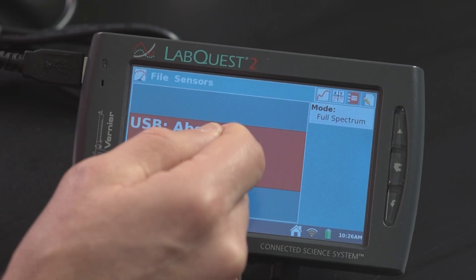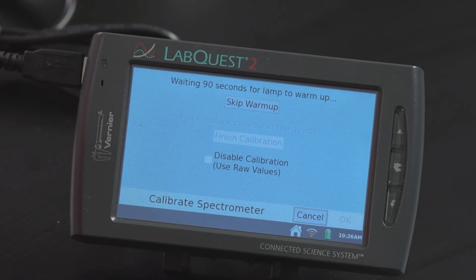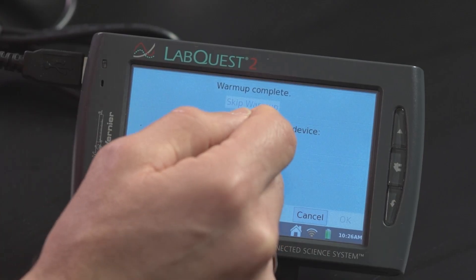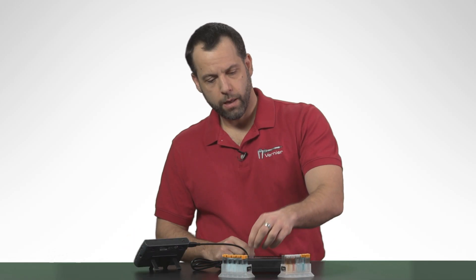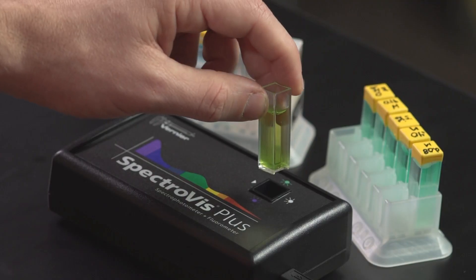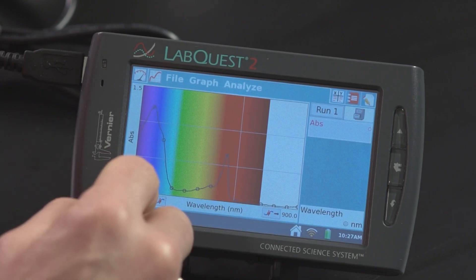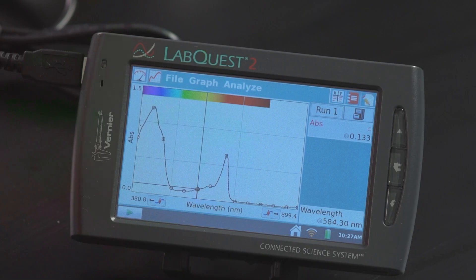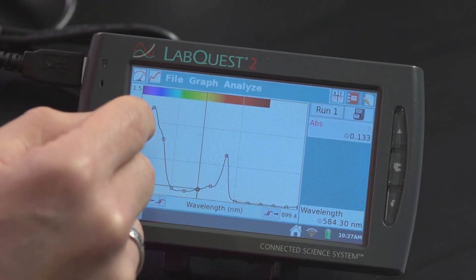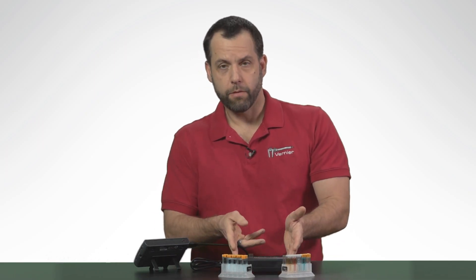The device is already warm, so once the screen comes up I can skip the warm-up. I'm going to finish the calibration, select OK, take my chlorophyll extraction, place it in the spectrometer, hit the collect button, and voila — there we have it. I'm going to double click on the screen again. And you can see right here — this is really nice, this is exactly what most teachers want to see — chlorophyll absorbs a lot in the blue and a little bit in the red. This is one of the reasons why I really love this device: this lab can now be done in about two minutes, and then you can go on to do some very interesting inquiry-based activities.